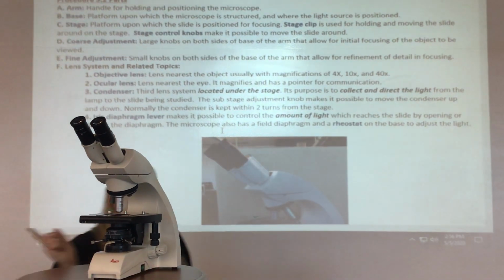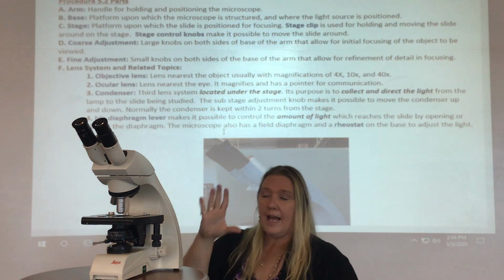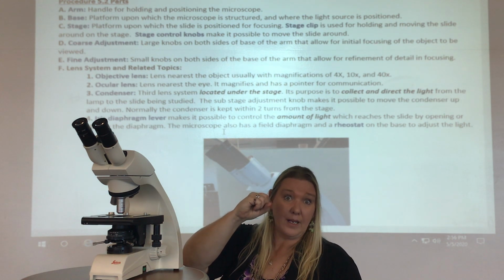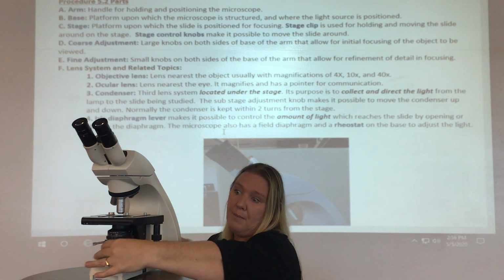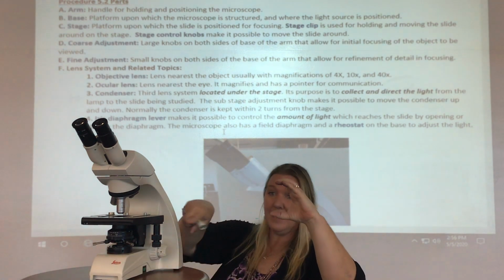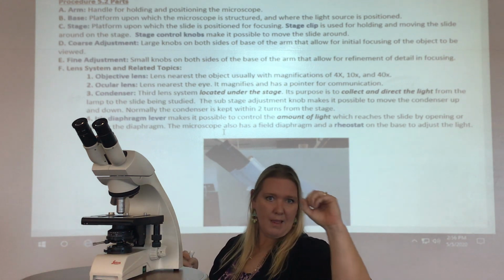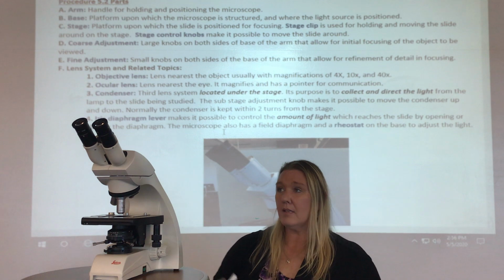What that's gonna do, if you think of iris, the color of your eye is the iris. As your pupil will open and close, so will the amount of light coming in and not being able to go in. As I move this, and I'll get to demo it when we go to the microscope in a second, this will open up the beam to then be condensed, to then shine through your specimen and into your eye, a little bit more or a little bit less, so you can adjust it with those things. Those are the basic parts.